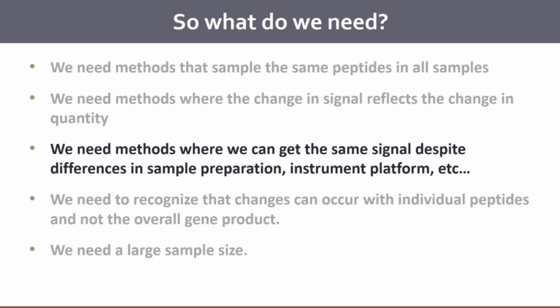One of the things that he tried to make a strong point of in the manuscript was that he didn't feel that he had a better machine learning approach. He just felt like he had data that was more reflective of what people were trying to predict, which is that he had chromatographic peaks from product ions, which was more predictive of what most people are trying to do in a targeted experiment. So that's the closest thing that's out there. But now that we have much better and much more DIA data, it may be worthwhile retraining some of these things at some point in time. It's on the very large to-do list of things.